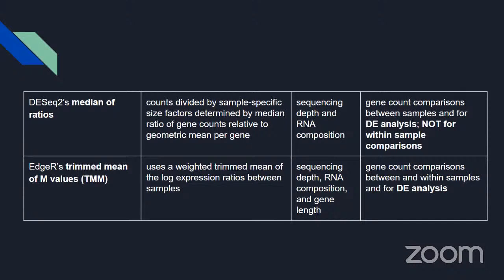The main thing they do is compare within the same gene, so they don't have to account for the gene length, because every single gene is compared between the two groups. A null hypothesis is created and so on, which I'll cover in detail in the next workshop.